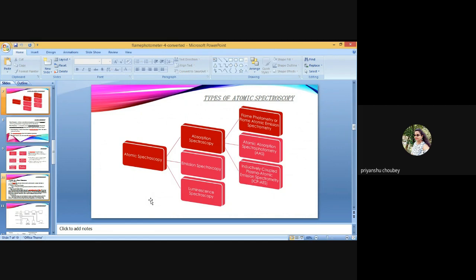In soil and plant analysis, one set of secondary standards is required for each multi-element extracting solution and one for each soil and plant digester.